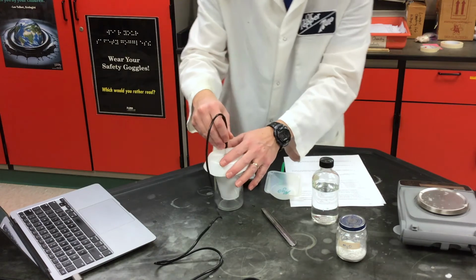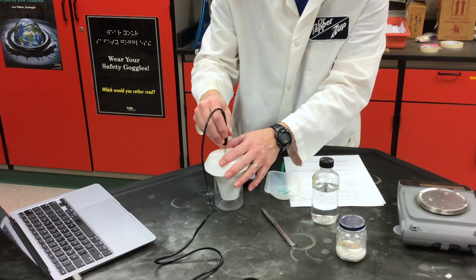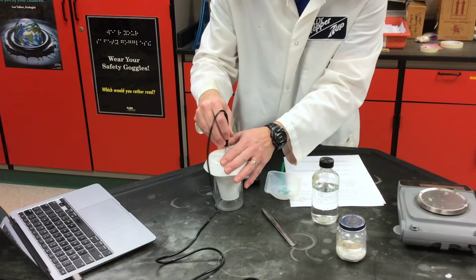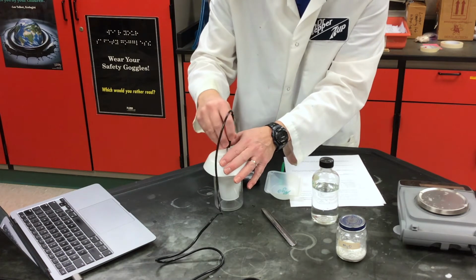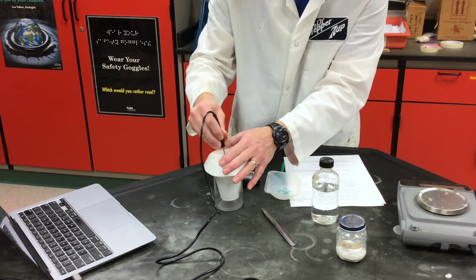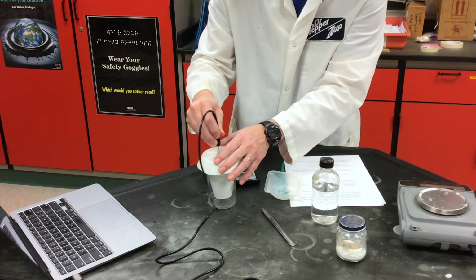I'm just going to keep an eye on my temperature on my computer, and I can tell the temperature is going up. Right now I'm at 19.9, 20.0, and I'm going to keep doing this until I get the final or highest temperature that I'm going to reach. So I'm at 20.5 right now, and I'm going to keep stirring, keep swirling. I'm at 20.7, 20.8.